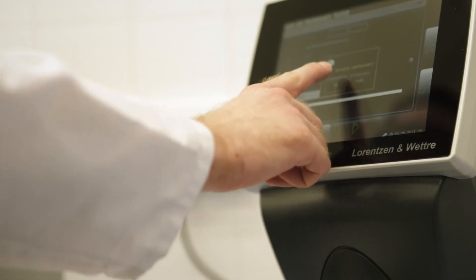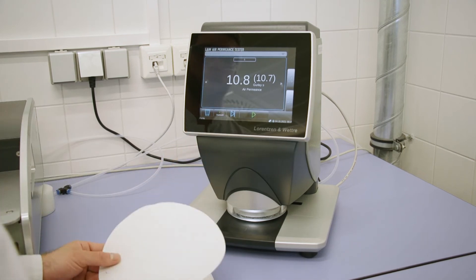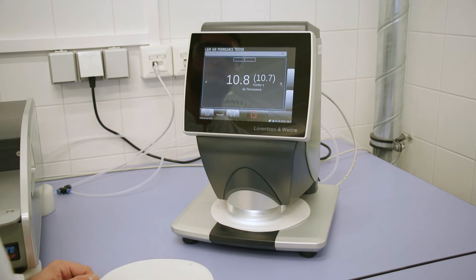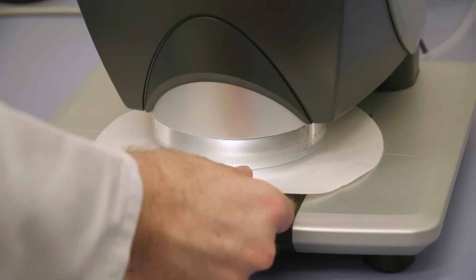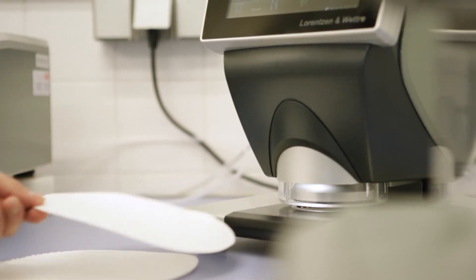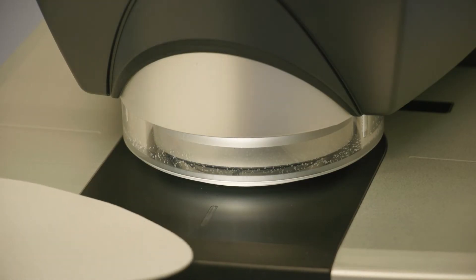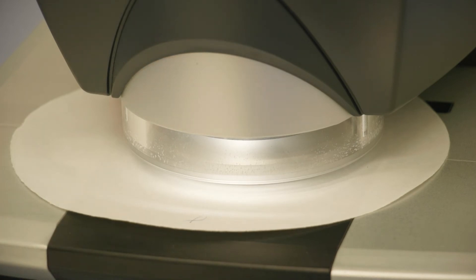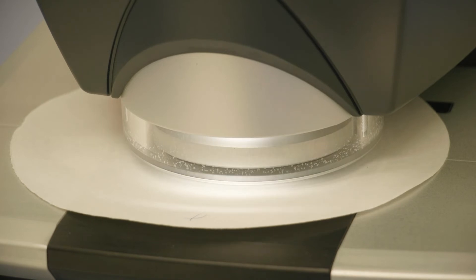It is interesting to compare such properties with the sheet porosity, as this decreases with increasing refining due to the compaction of the sheet. In addition to these physical properties, papermakers are interested in optical characteristics such as brightness and opacity. We perform a number of other standard tests for evaluating sheet properties.